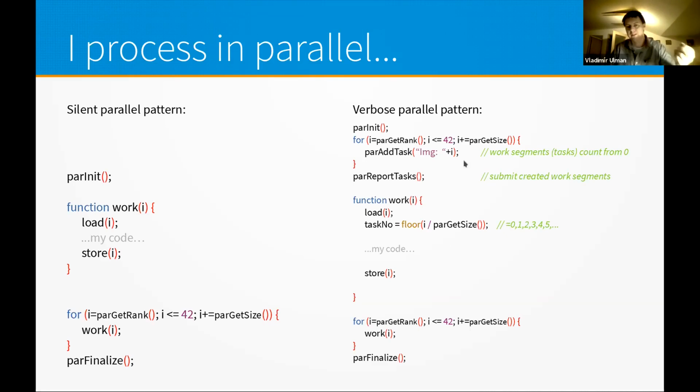The first edit progress bar is referred to with 0. The next edit progress bar is referred to with 1, and so on. Right. So with this formula, we basically bring us from this i to the appropriate progress bar that was created here. And now that we have the reference to it, we report the progress.